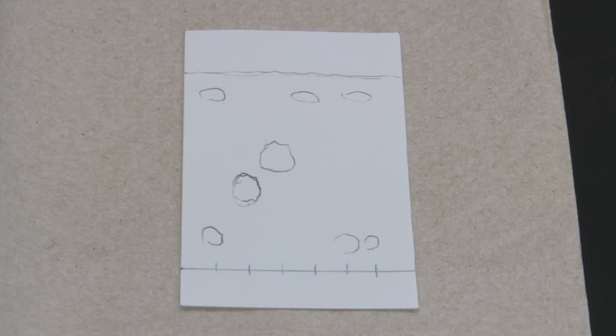Compare your unknown spots to the known spots. You should be able to match its components to the knowns based on how far they traveled. For instance, in this TLC plate, the unknown has two components which match the known samples in positions 4 and 5.